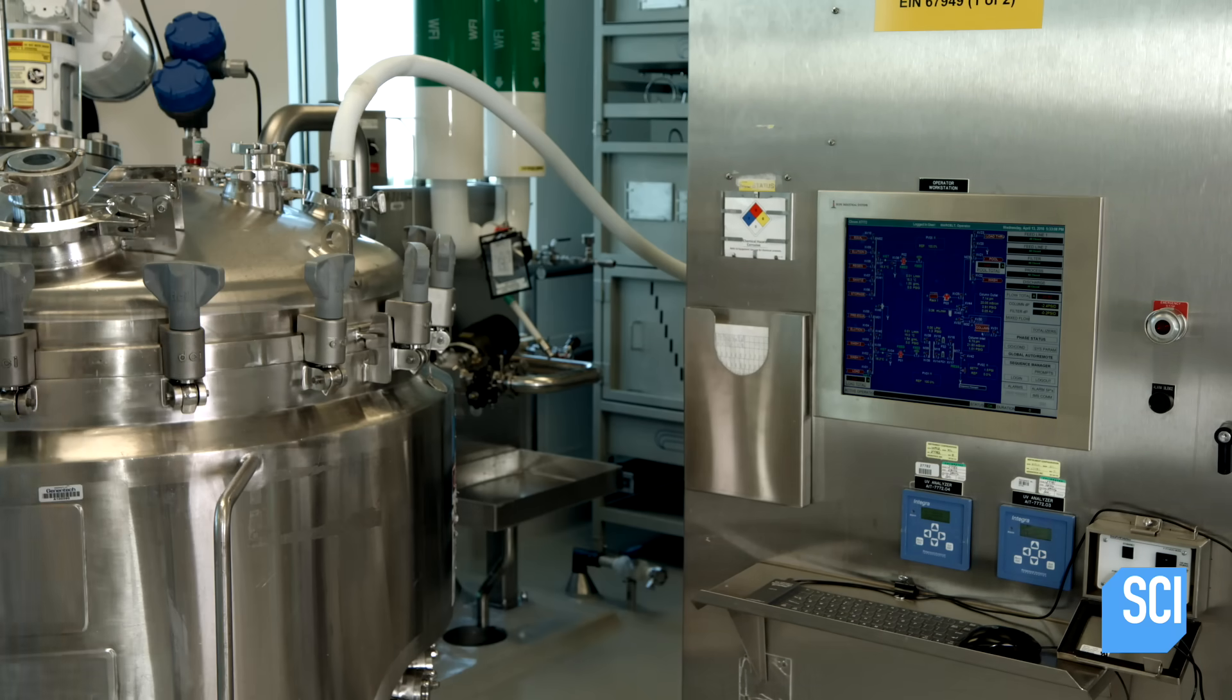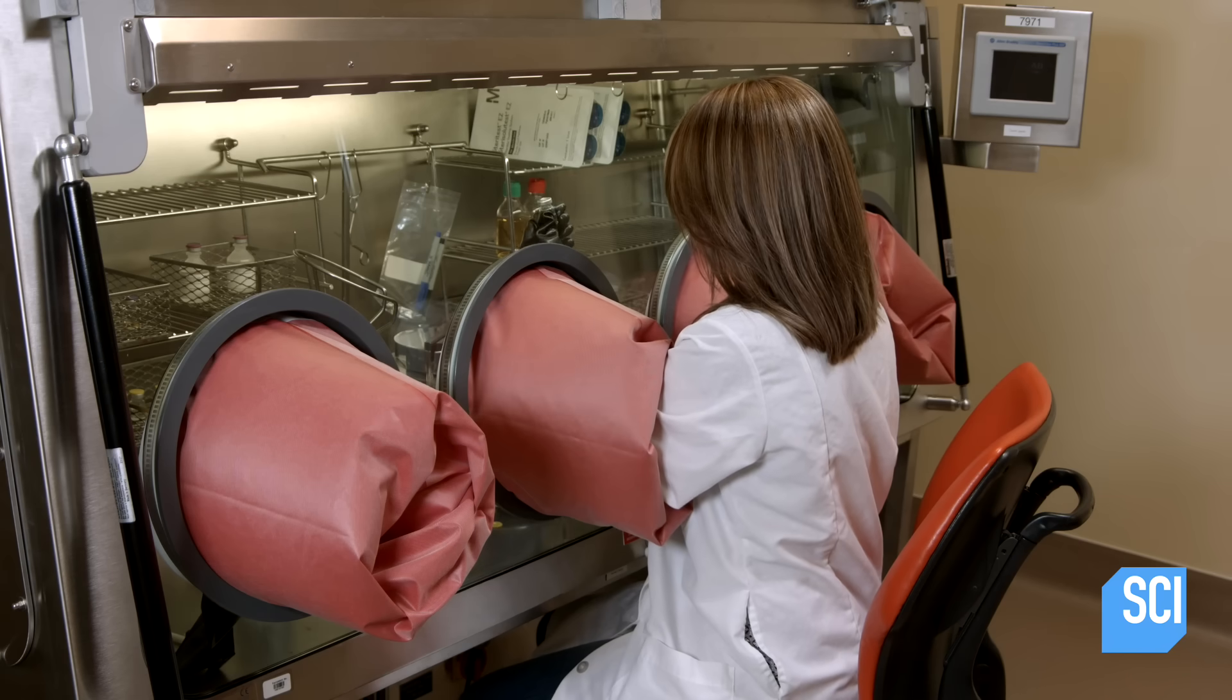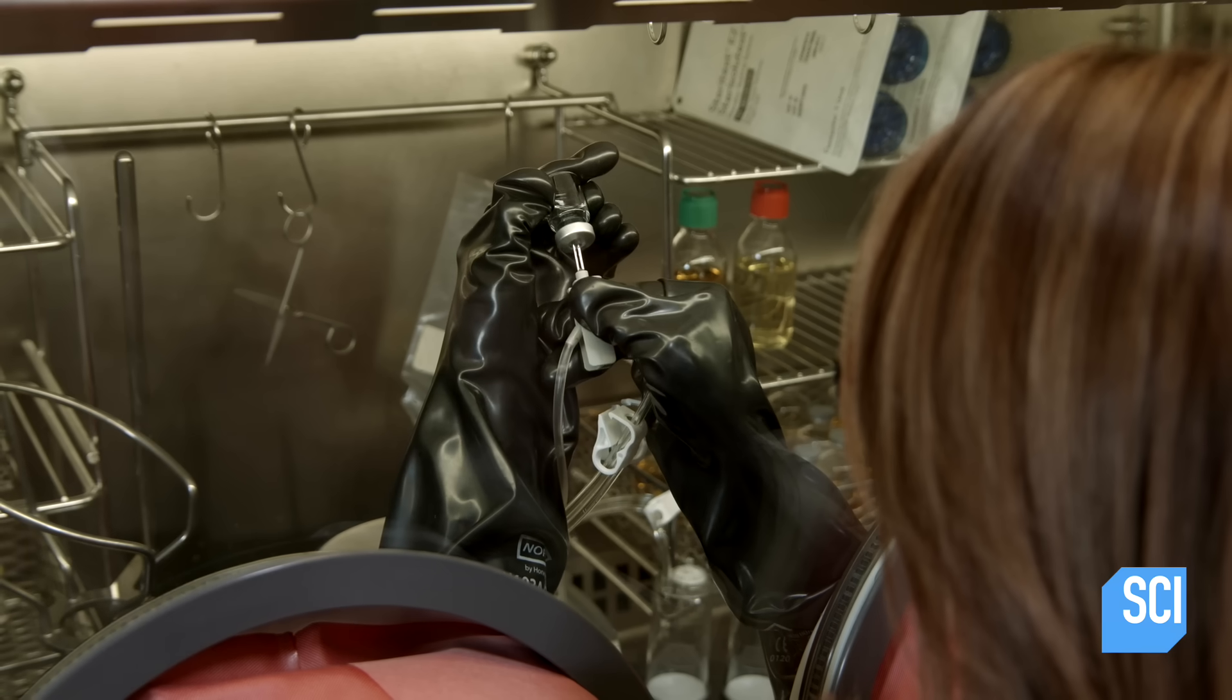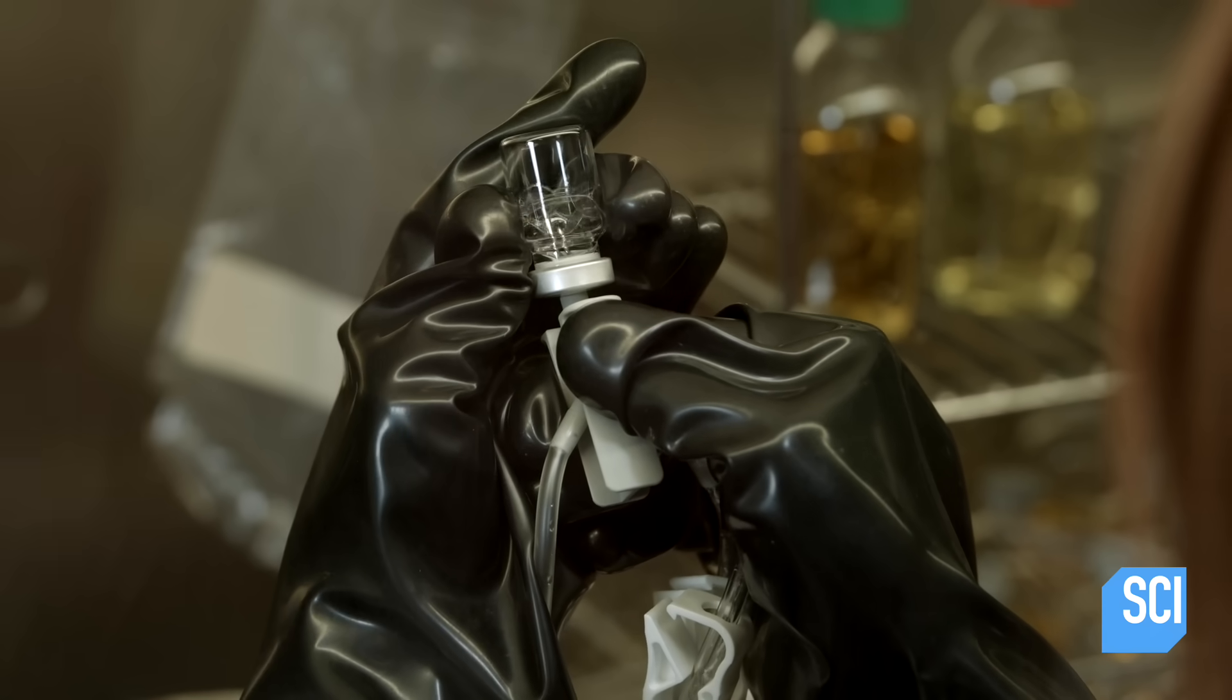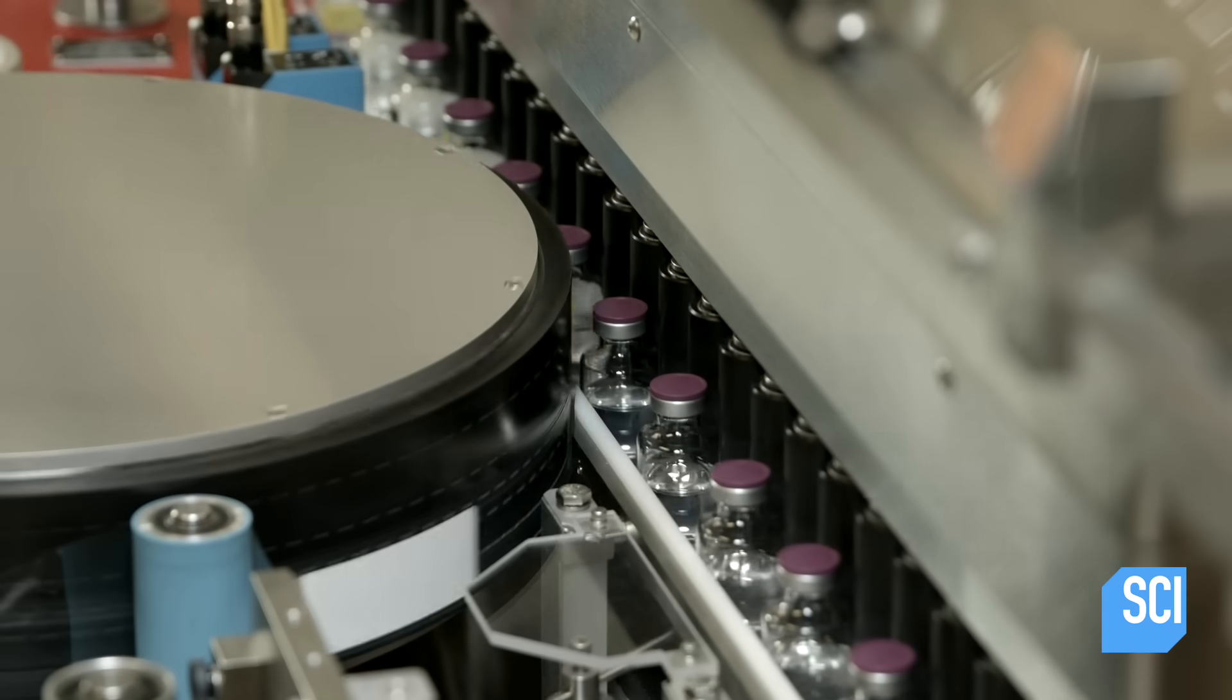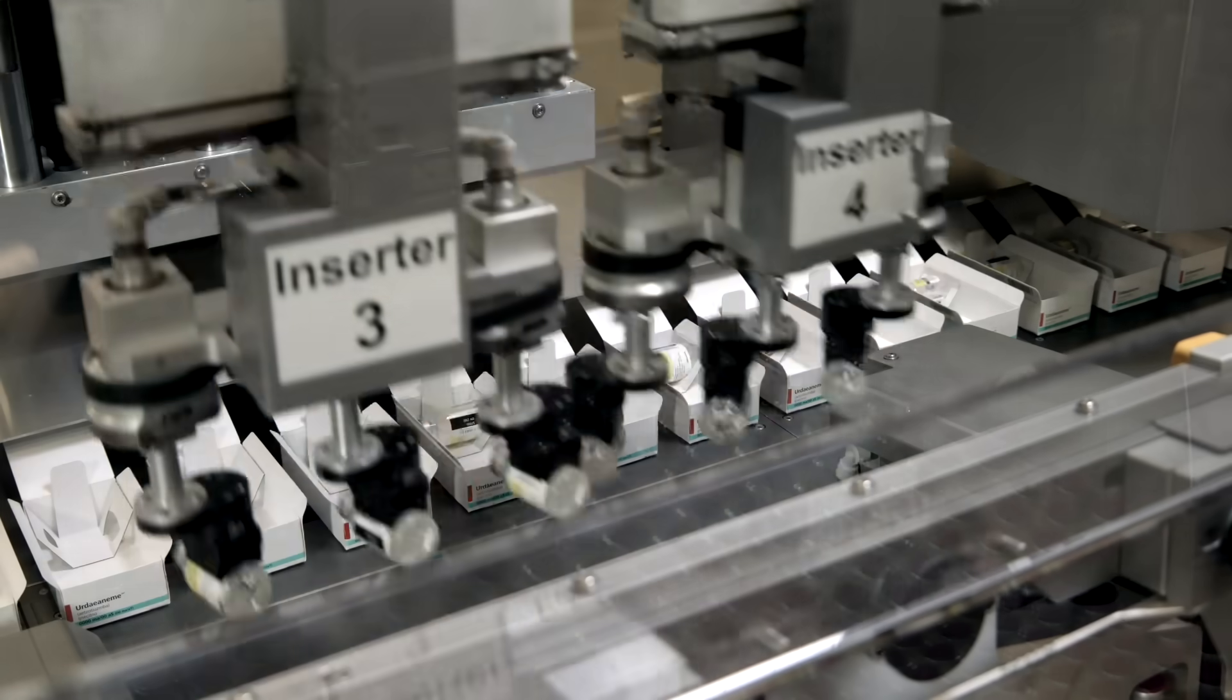Finally, this technician takes a sample and conducts a test to ensure the medicine is sterile. Grown in living cells, these biologic medicines are now on their way to potentially making a difference in people's lives.